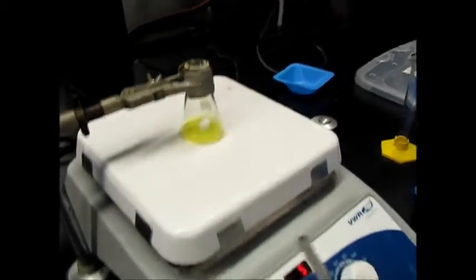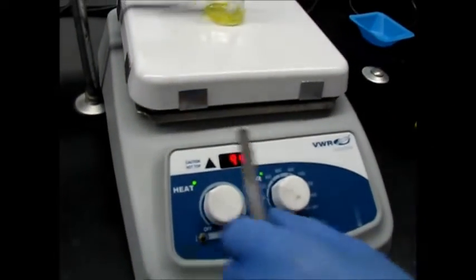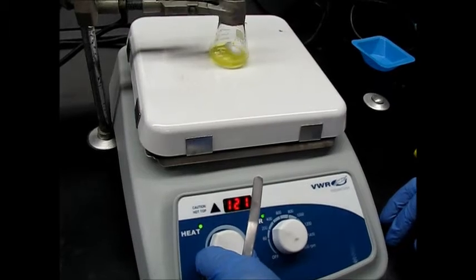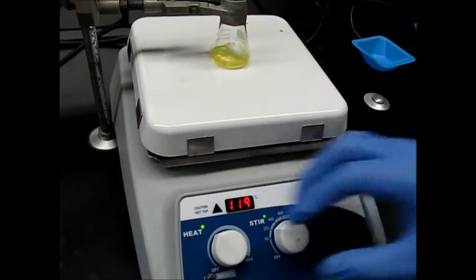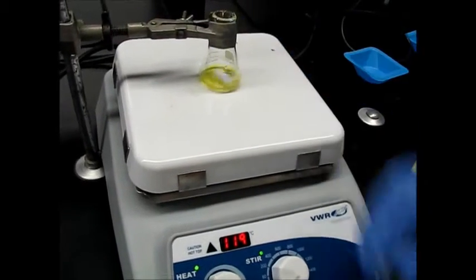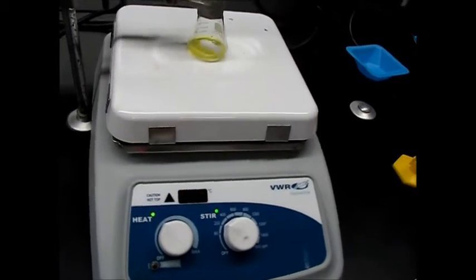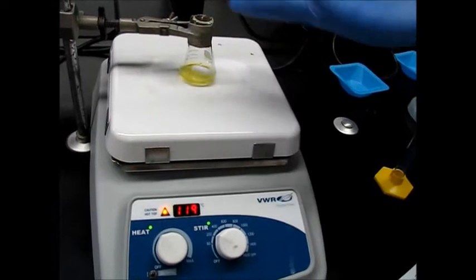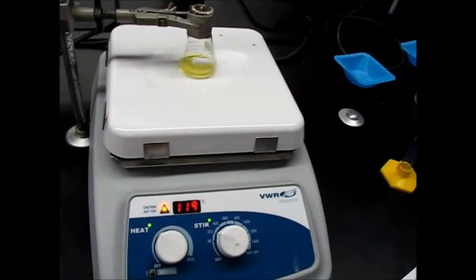So go ahead and turn on the heat. Since we're aiming for around 55 to 60 degrees, we're going to set it to double that, so right at like 120. Cool, that's good. So we'll leave it stirring with some heat, only for about 3 or 4 minutes. Once we get everything dissolved, we should see a color change from yellow to kind of a white, cloudy, clearish color.